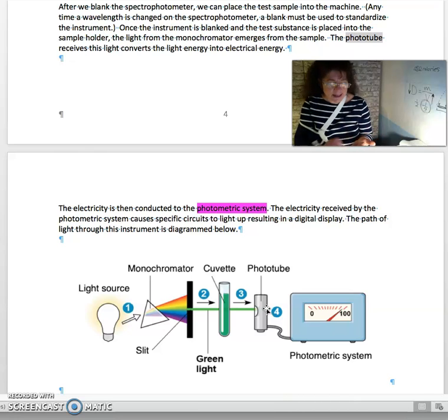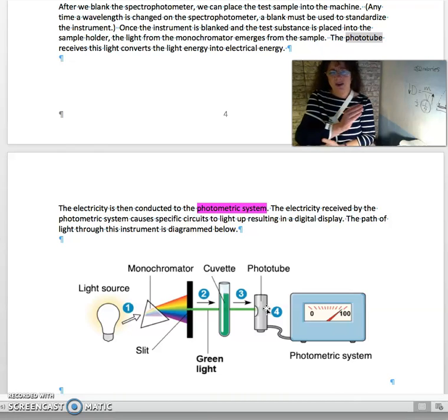In that way, we can take a note of that and we can accomplish two things. We can note what our device records for the transmission and compare it to a known for water, for distilled water. I'm sorry, I can't really work that well with my broken arm. But in comparing our results for distilled water to a known result, we're making sure that our device is calibrated to a standard. That's number one.